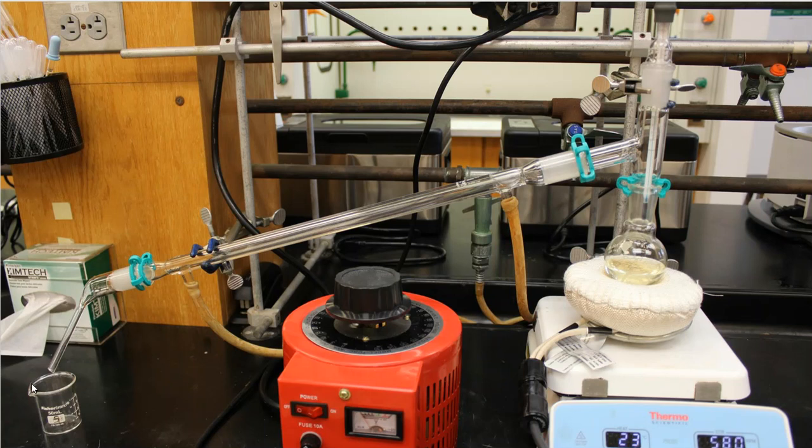As you can see over here on the right-hand side, this is my boiling flask. In that boiling flask, I have that top layer from my separatory funnel, the organic stuff that I need to distill at this point. I'm going to heat it with a heating mantle that's right here, and this is a variac that will control that heating mantle. So I'll flip this button on and crank the heat up, and that will make the heating mantle heat up like it's supposed to. That's why we use it.